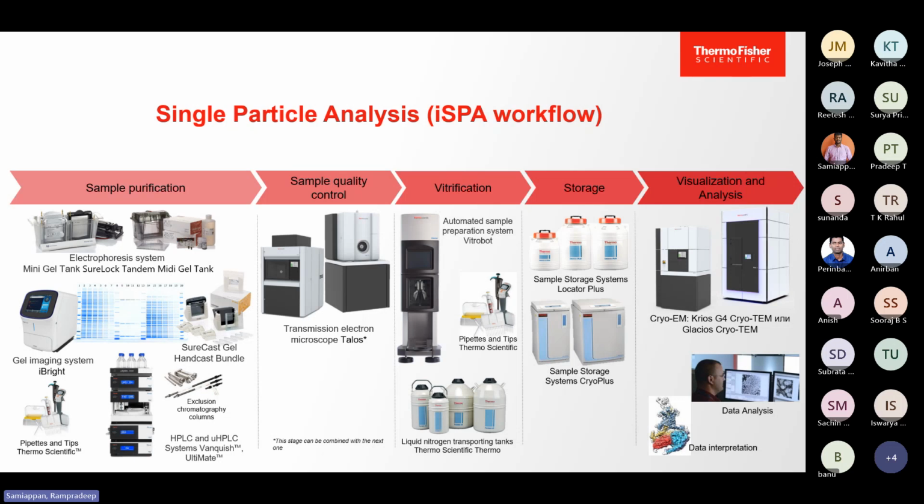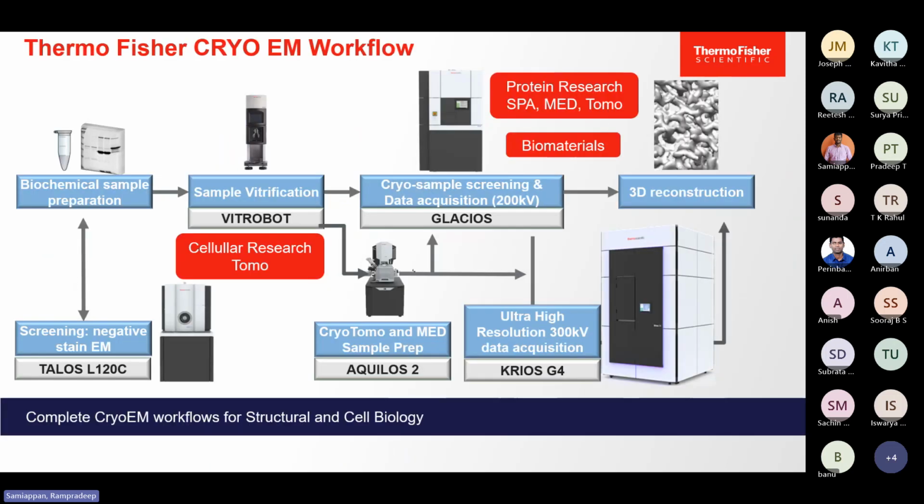Then the next step is to go for cryo-EM with a high-end data collection, where you can go through all the process and do the data analysis later on. For example, if the samples are prepared and you want to store them for a longer time, of course, you can. You can store it in a liquid nitrogen dewar, and it has a storage capacity. At least for the first 14 days, your sample will be really good. But a longer incubation time in the dewar might cause ice contamination as well. I would say, try to image your sample as quickly as possible in order to avoid other external factor issues.